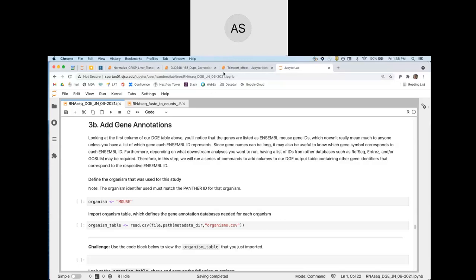So how was FastQC doing it? Because I remember at some point it said, this is the number of reads you have, and this is what you would have if you deduplicated. So what it's doing there is, remember, that's only a sampling of the reads from that FastQC analysis. That's why I take that with a grain of salt. It's only looking at the first 200,000 reads, and it's only looking at the first 50 base pairs of those reads. So that number is really a drastic overestimation of how many duplicates there actually are.